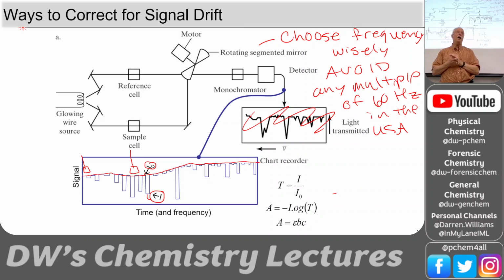So something's going on with the interferences, right? But y'all got to know what 60 hertz is. So you got to know that. It's like basic science knowledge. In Europe, it'd be 50 hertz in Europe. So avoid that.